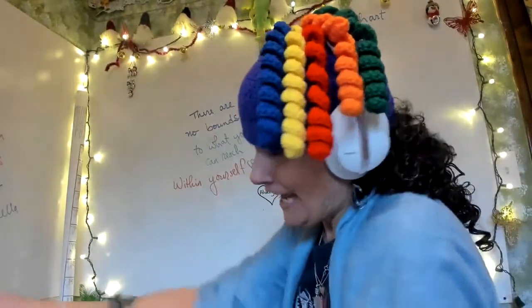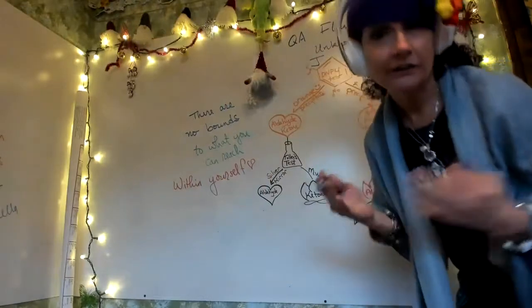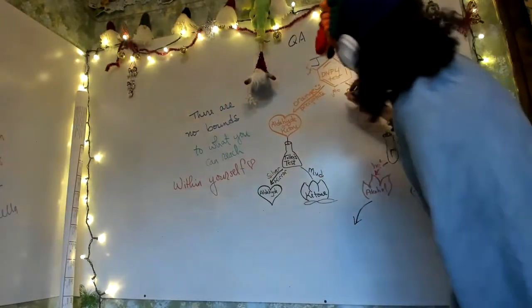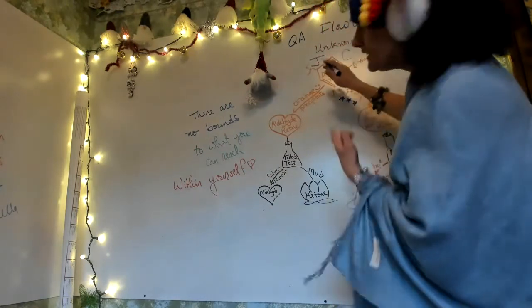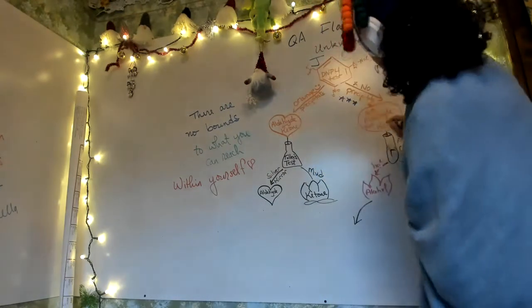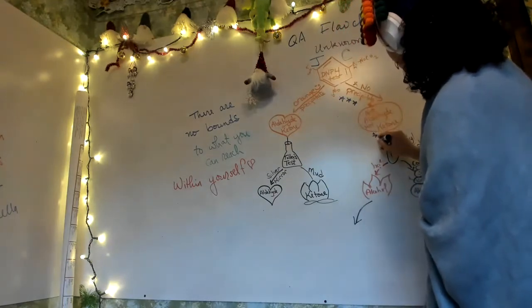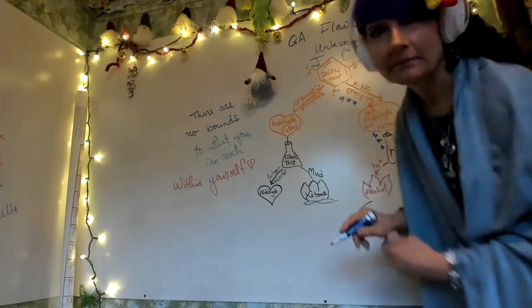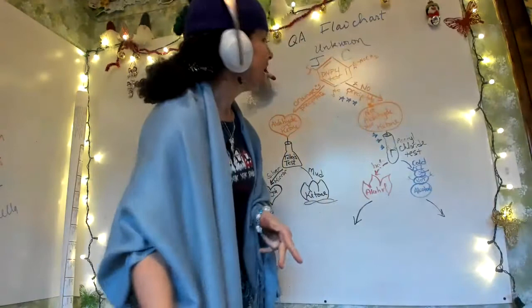J and C, sorry, let me find the right color marker. And then you would say what path you followed. Either with stickers or stars, you can do moons and stars. So for J, we didn't get an orange precipitate, and so we went to the acetyl chloride. What happened with the acetyl chloride, I cannot remember, but you guys hopefully do remember.